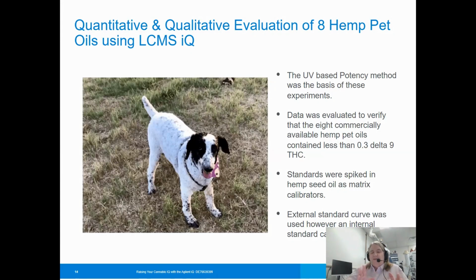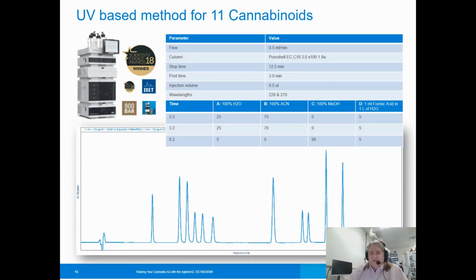And so we took the data and we went out and took their hemp. And not only did we do their hemp, we took several different bottles of their hemp to test not only the accuracy, but that we could all get the same results from the same batch from different bottles. And then we tested batch to batch. So this was quite, I think, an extensive test.